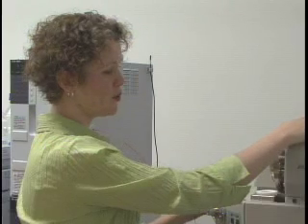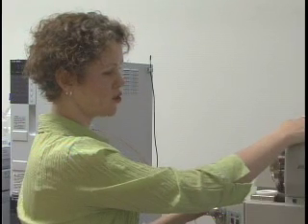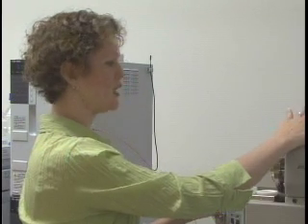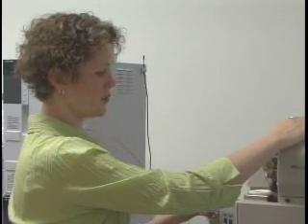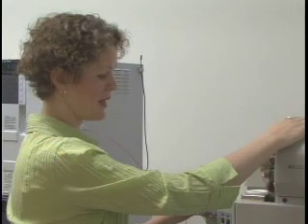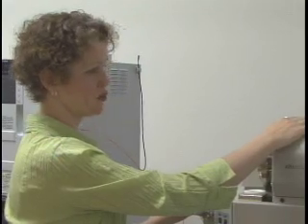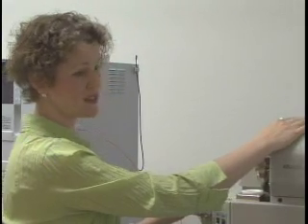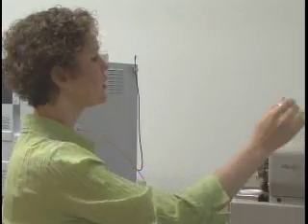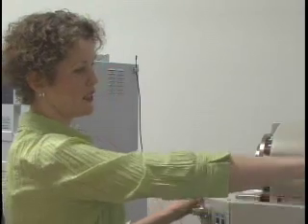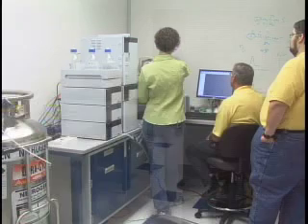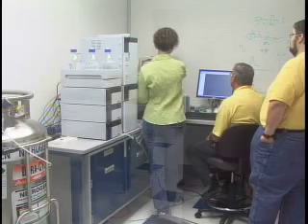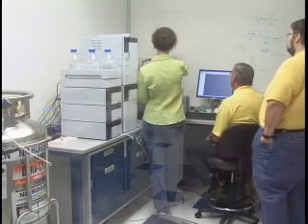Behind the orifice plate you've got the Q0 portion of the instrument, which occasionally needs to be cleaned. We're not going to break that down today because in order to do that you have to vent the system. Then you've got the three other quadrupoles and the linear ion trap inside this housing, and the detector at the end.